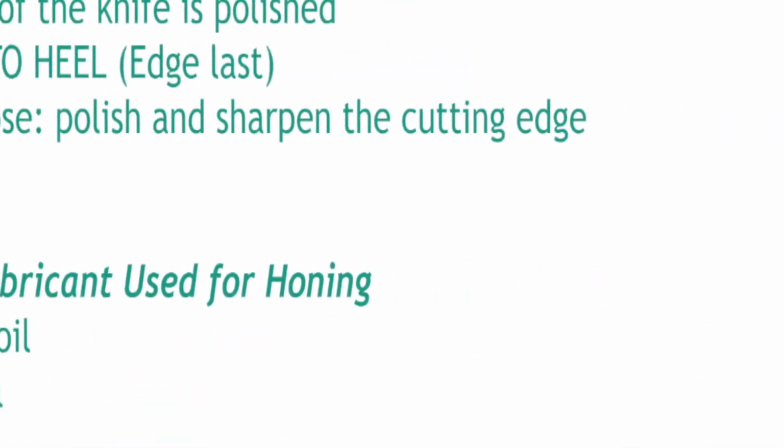Okay? So stroping, wag na nating tandaan yung process kasi alam na natin HH, heel to toe. So obviously, ito yung opposite. Okay? What you need to remember is the two. Okay? Honing and stroping. Huwag niyo kakalimutan. Baka, ala sir, nakalimutan ko yung isa. Ay, abot sa iyo. Bahala ka dyan. Okay, so we also use lubricants.